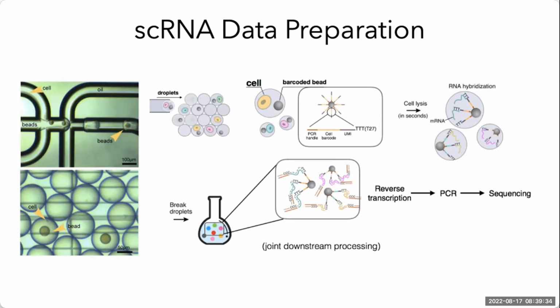For quantification, we again have two types of approaches. We can quantify based on the full length of the reads, and we can also quantify based on tags. Quantification based on the full read length tries to achieve a uniform read coverage for each and every transcript.